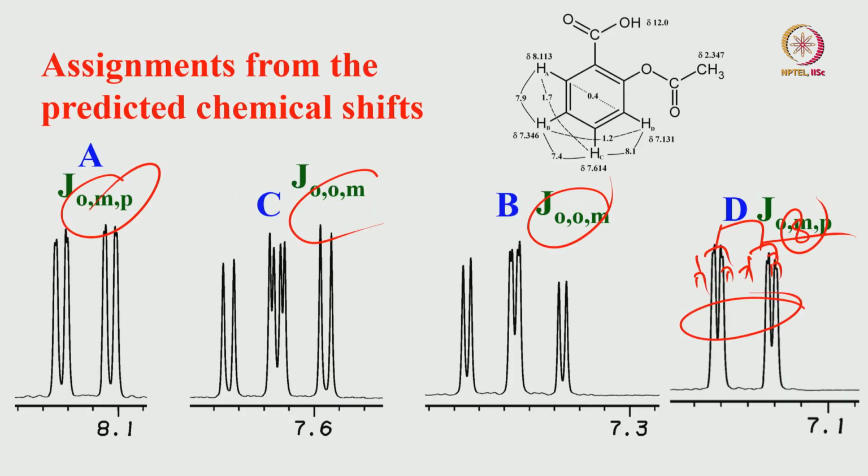So, now you have fairly got the idea of how we can analyze the spectrum of a simple molecule. With a lot of examples we took yesterday, of molecules with only aliphatic groups, based on the multiplicity pattern we made the assignment of all the protons without any difficulty, based on shielding and de-shielding, where it is resonating, and the multiplicity pattern, which tells us what group is sitting next to it.